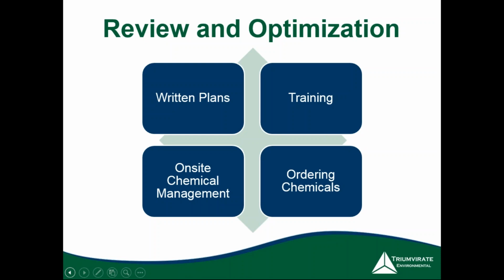And then when new folks come on site, new researchers or any interns maybe that come in, it's important that they get the right training as well, because if they're not trained accordingly, they can kind of wreak havoc on your chemical inventory program by just doing whatever they want to do. So it's really important to make sure those things are in sync.